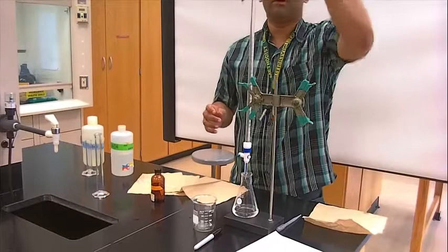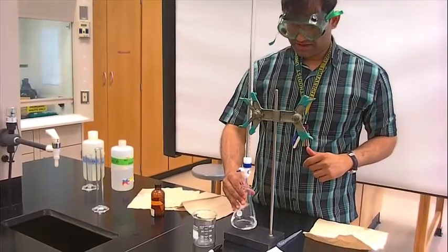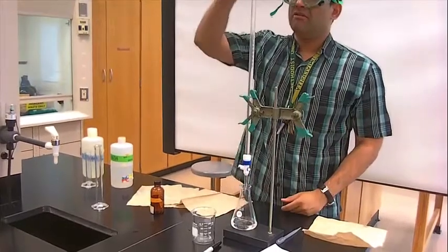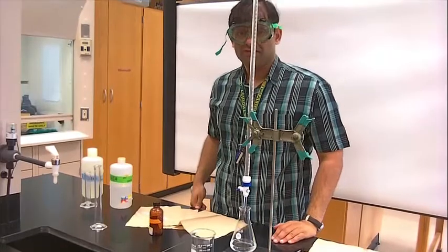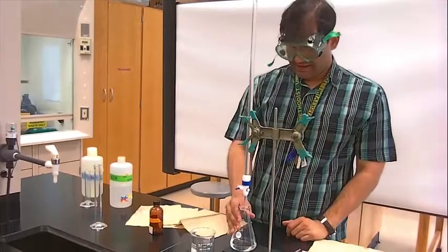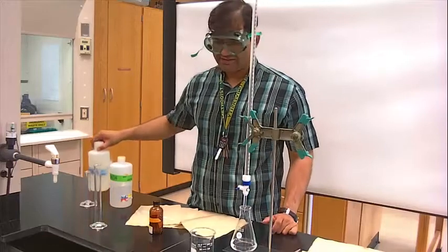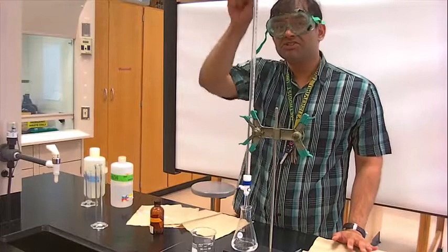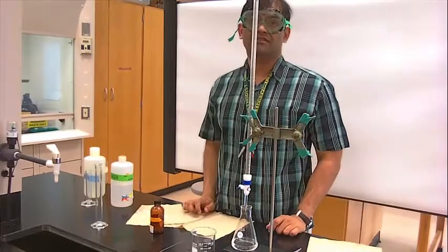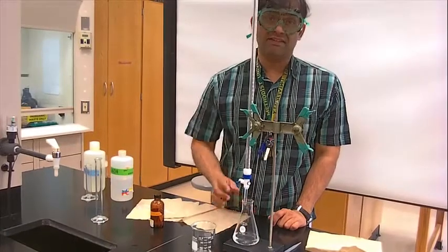Okay. So here I have the volumes facing me, and shake up this titrand. Remember now, I have 0.25 molar sodium hydroxide, which is a base. In here I have acetic acid, or vinegar, which is an acid. What we're really trying to do here is figure out how much of this sodium hydroxide neutralizes 5 mils of this acetic acid.